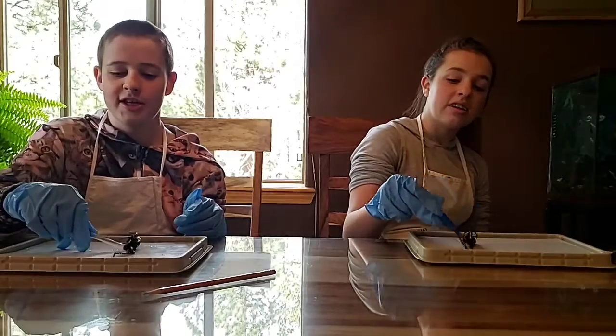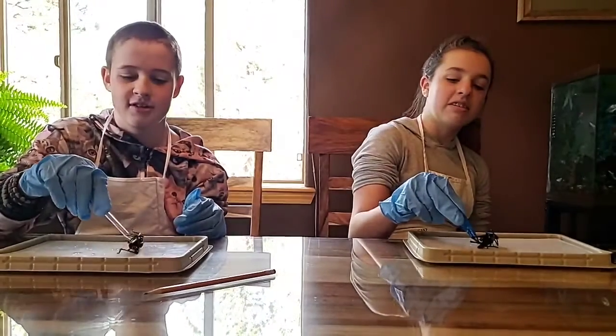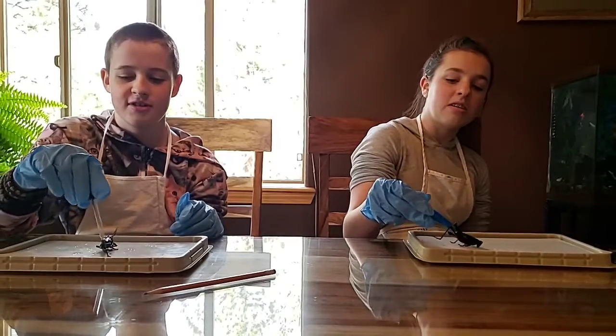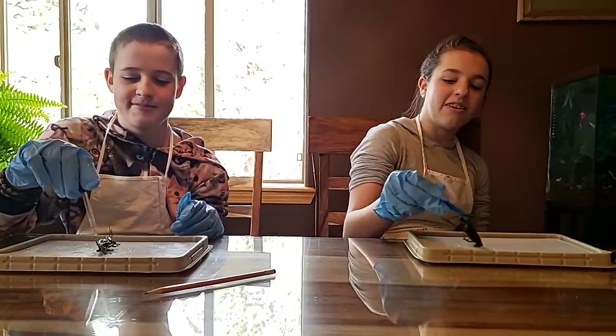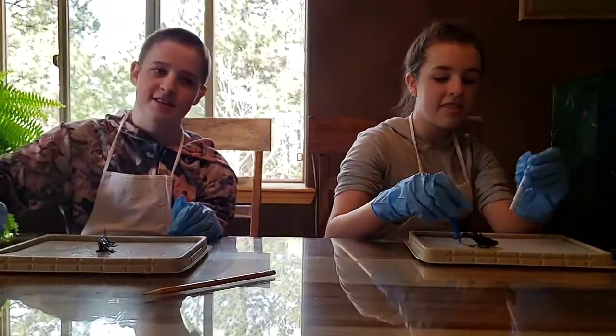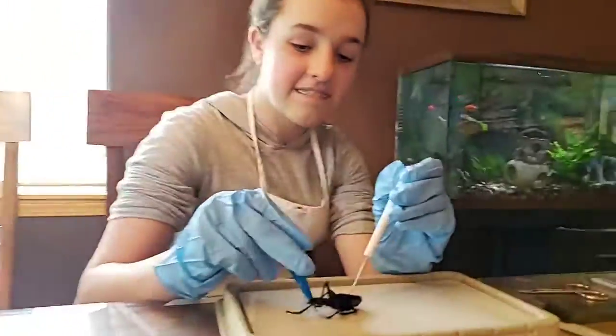And now the locust. Doing an insect, a locust. Grasshopper. This isn't a grasshopper. All right, so we're going to get started. I'm going to move this in closely so we can start doing our class.